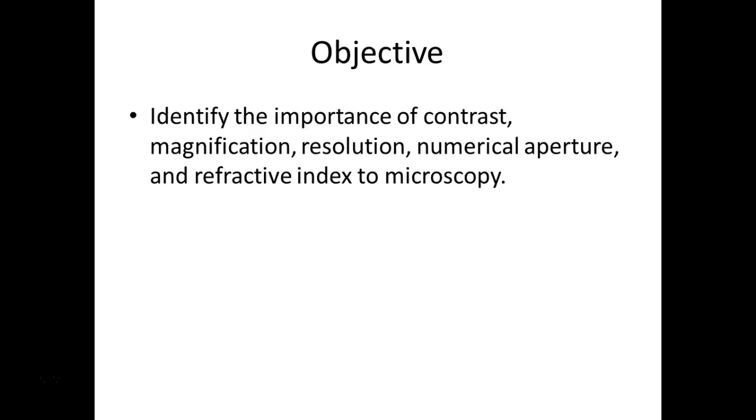So as it applies to microscopes, there are important concepts that you have to take into consideration other than just magnification. And that's what we're going to define and talk about here.